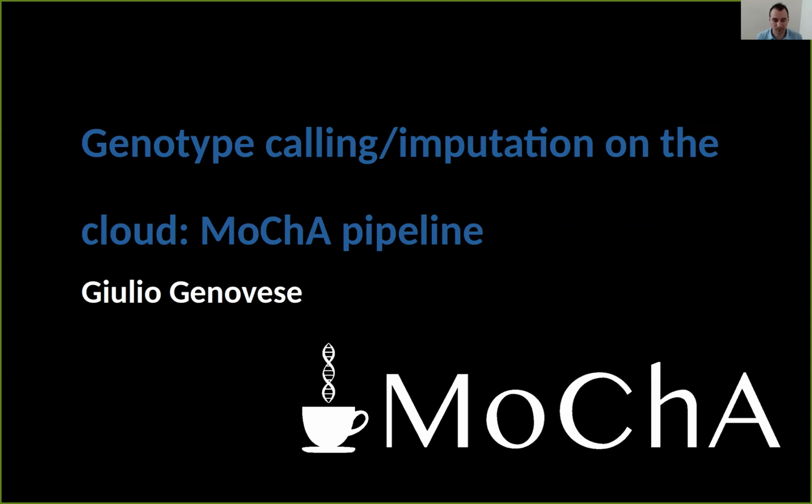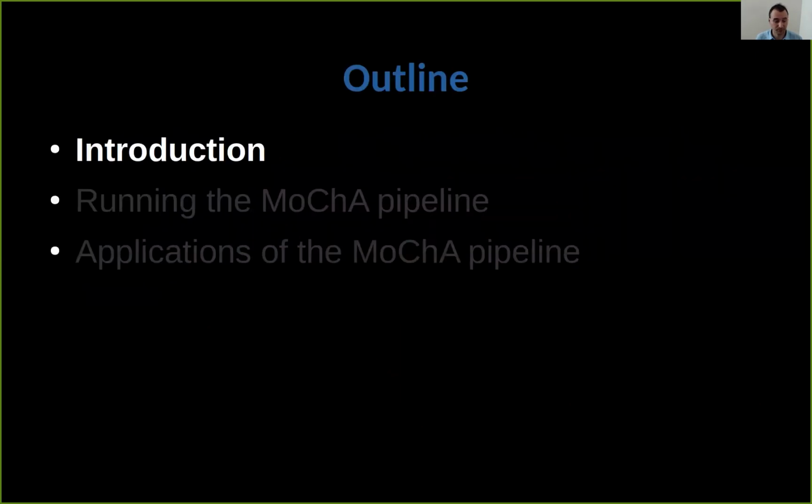Hello, everybody. Today, I'm going to talk about the MoChA pipeline and how you can use it to perform phasing and imputation of DNA microarray data in the cloud. So as an introduction, what is phasing and imputation?